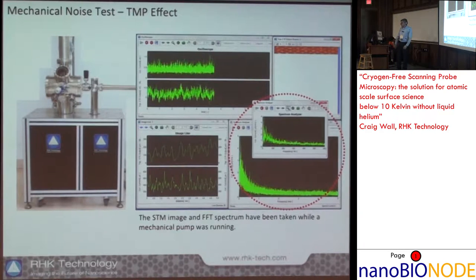This shows an STM image being collected — we're looking at the tunneling current, the spectrum analyzer signal, and the FFT. We can see the signal during operation with the closed-cycle cryostat on and the various pumps on. The FFT spectrum is fairly clean.